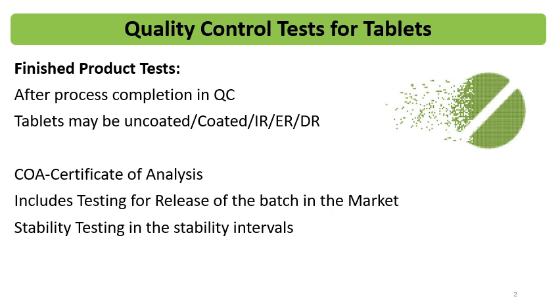The reason behind not performing the disintegration testing for extended release tablets might be that these tablet formulations are not meant to be disintegrated, and the disintegration time is very long for the extended release type of tablets. That's why generally the DT test is not performed.